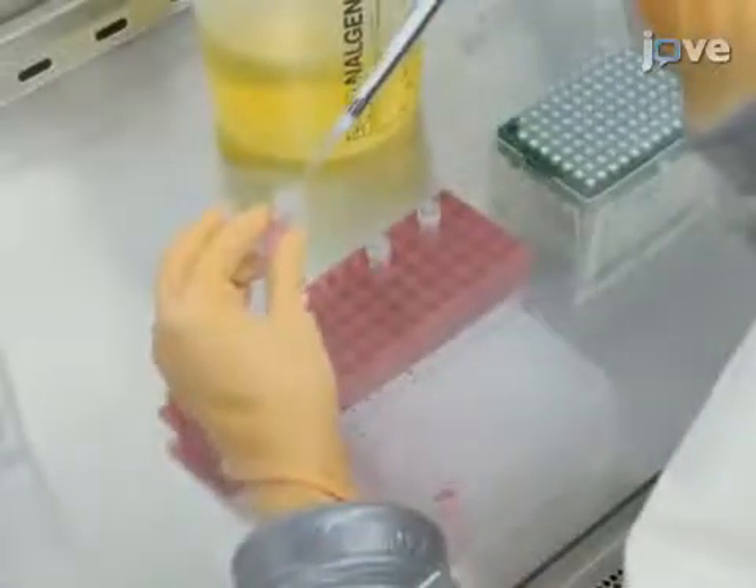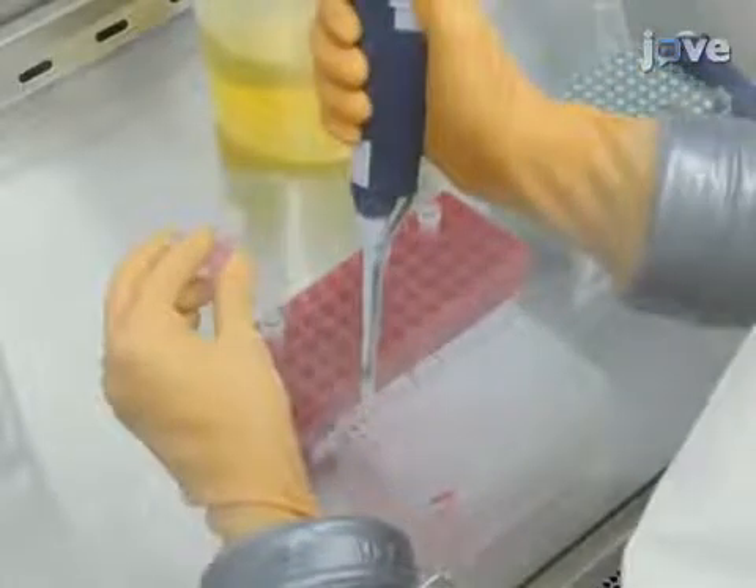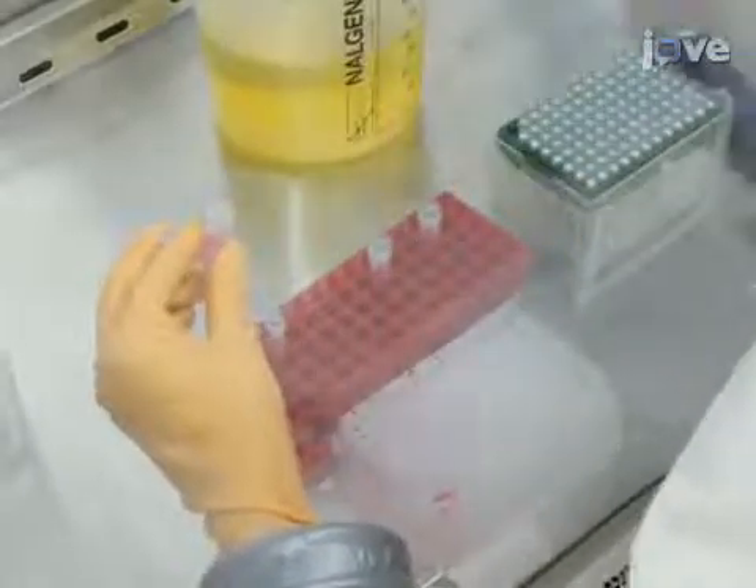Remove 50 microliters of virus sample and control virus and place them into 450 microliters of Dulbecco's modified Eagle's medium with 2% fetal bovine serum.